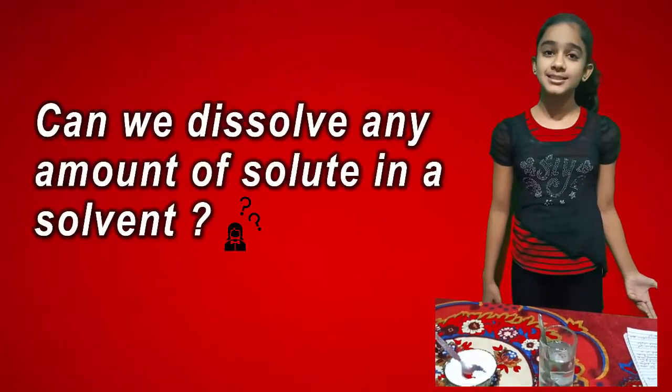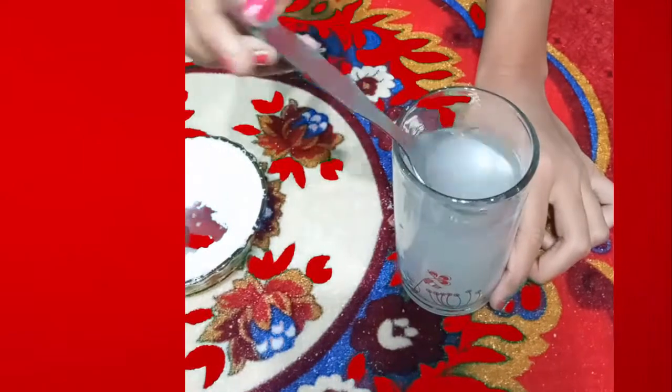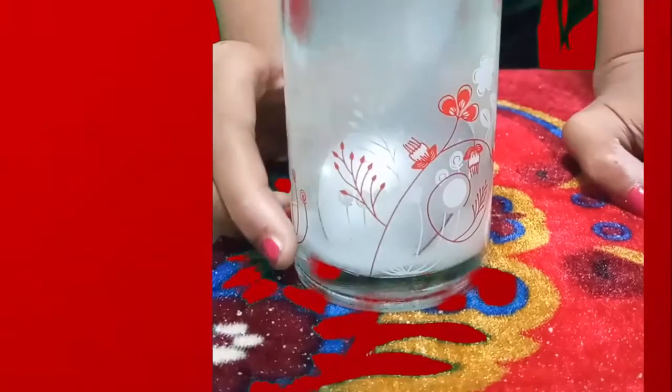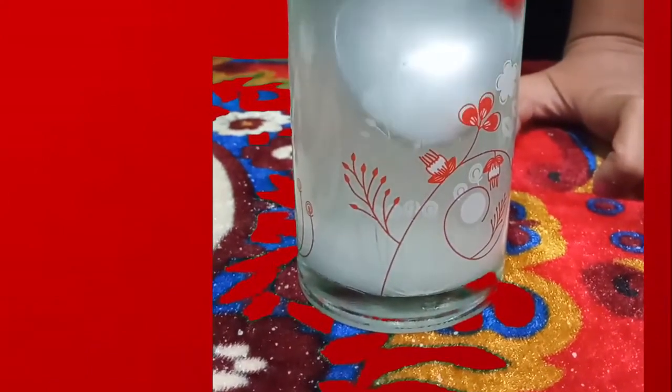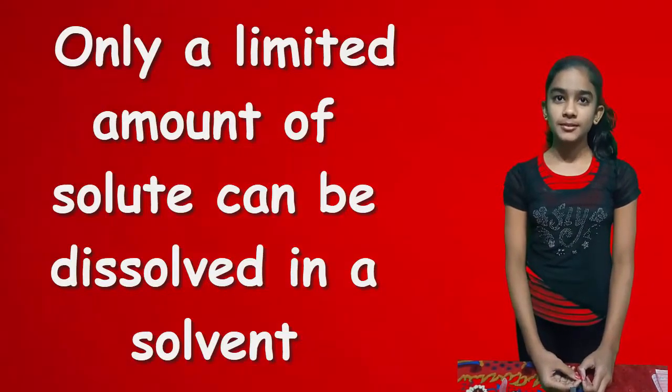Here the question arises: can we dissolve any amount of solute in a solvent? Let's see — keep adding more and more solute to the solution. See, some salt is left at the bottom; it is not getting dissolved. So, now we got the answer to our question. No, only a limited amount of solute can be dissolved in a solvent.